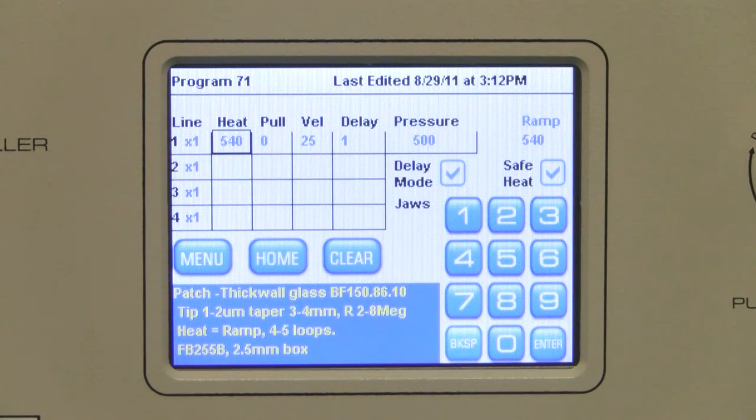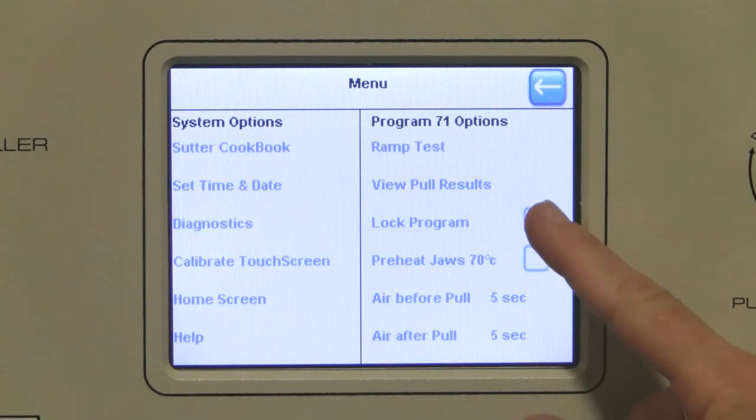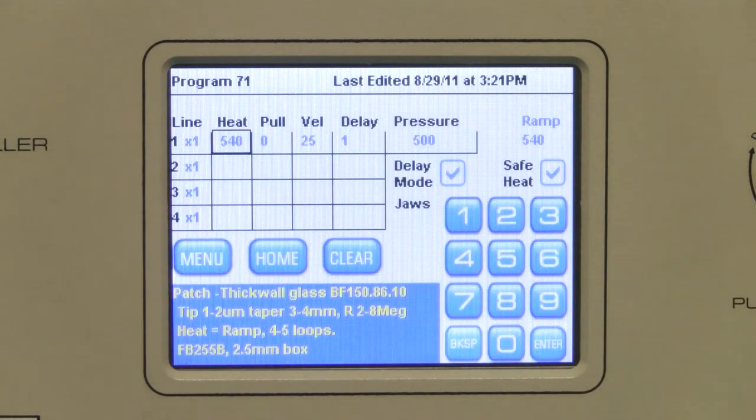Note that any parameters previously stored in program 71 would have been overwritten unless the program was locked. To control protection of your programs, you can press menu and toggle the locked program checkbox on or off. If a program you are copying is locked, the new program will automatically be unlocked. This is different from the behavior on the P2000 puller, as we will see in a moment.